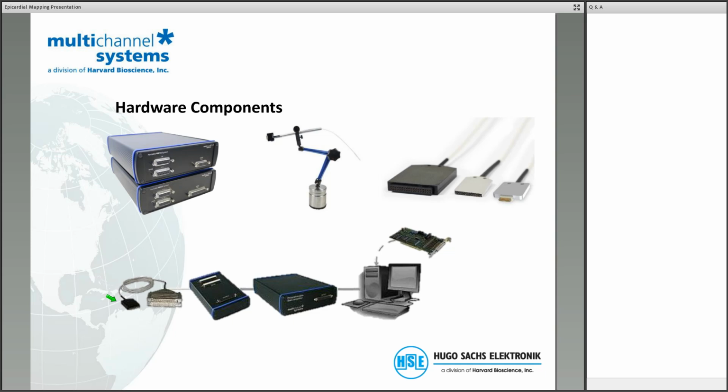And typically we work with either 36 electrodes, 32 electrodes, or 64 electrodes. So for that purpose, you're using one or two of these 32 channel head stage amplifiers. In these head stage amplifiers, we usually have a 2 up to 10-fold gain.